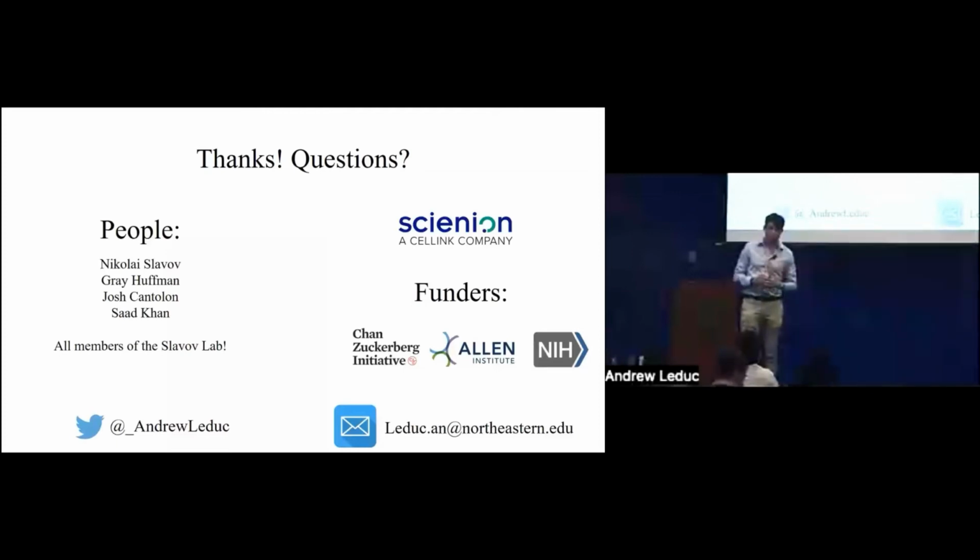Thank you. Yeah, lots of good questions. So I didn't get too much into the specifics of our exact sample prep workflow, but as there are many, many potential sources of batch effects, one could be that cells are grown in different growth media. To control for that, ideally you're able to differentiate the proteomes of cells that come from the same sample.